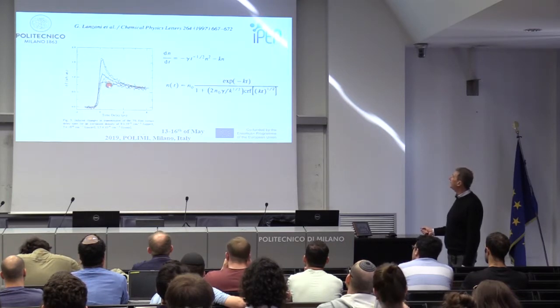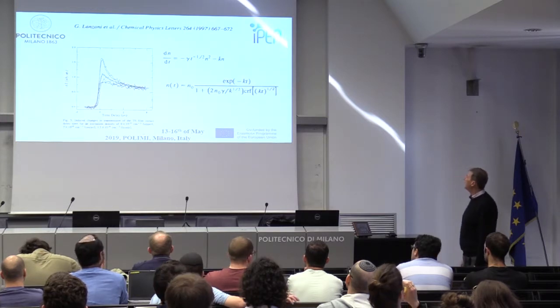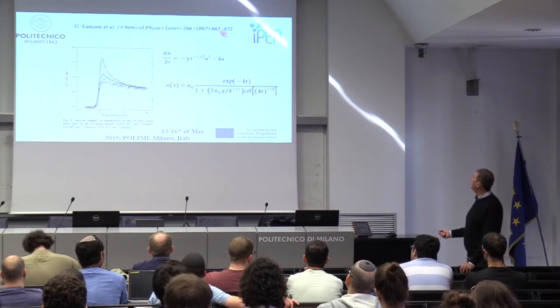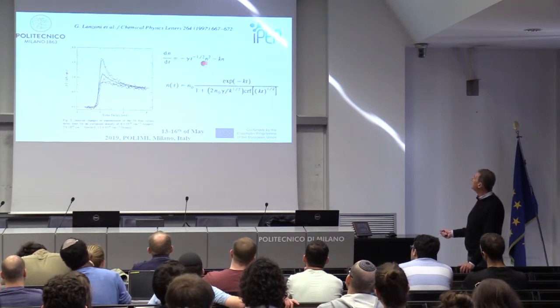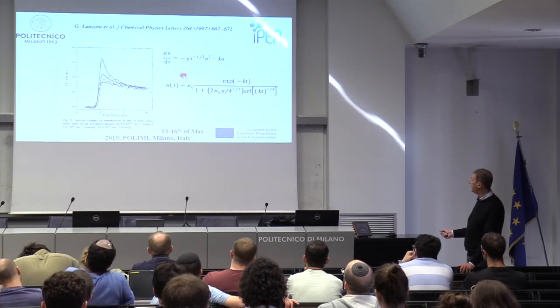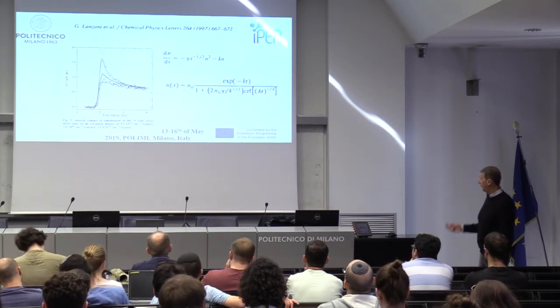You see here that the measurement is extremely noisy because I think I was using a very noisy laser at that time. Anyway, the way we could reproduce these kinetics is assuming a one over square root of time for the bimolecular decay, and also some kind of monomolecular decay. So that's an example.